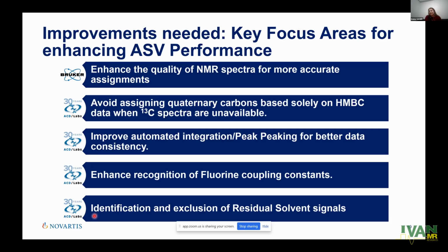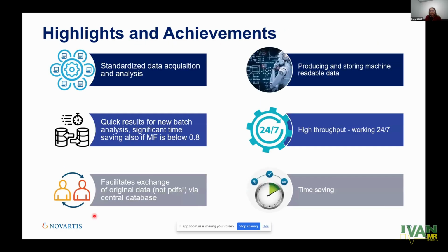For a chemist, I think all NMR experts will be able to recognize some solvent from the chemical shift. But for the chemist, if it is done automatically and done in a good way, that will help the chemist to find that this signal is not from my molecule, but a residual from my solution. And voila.